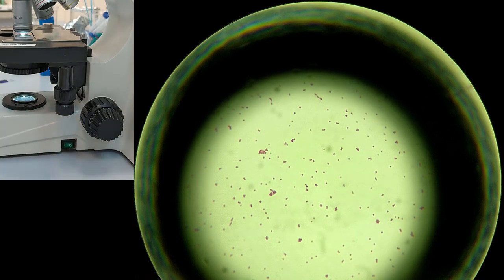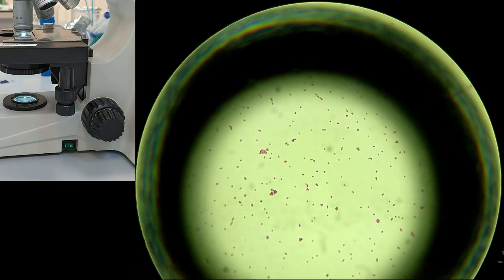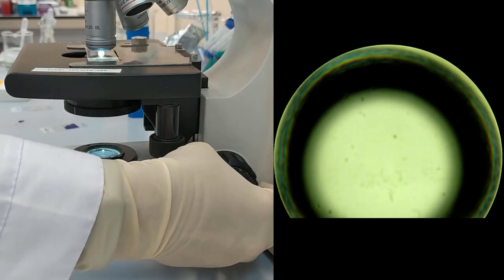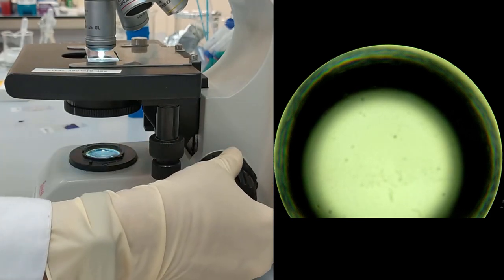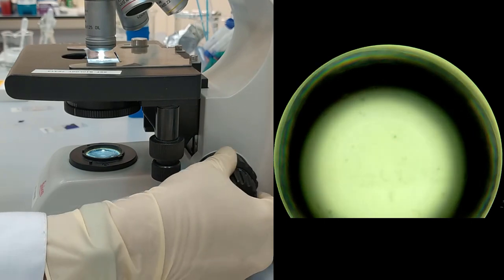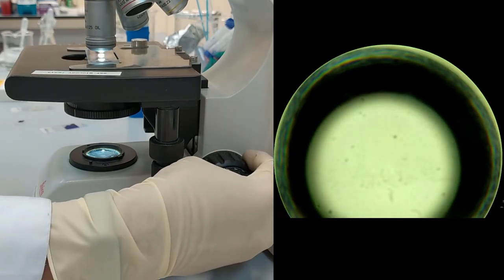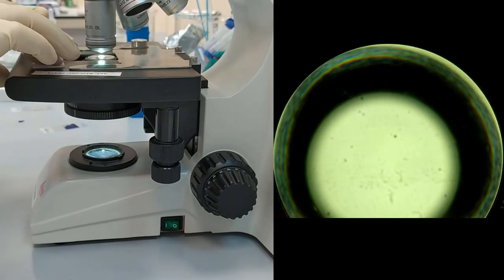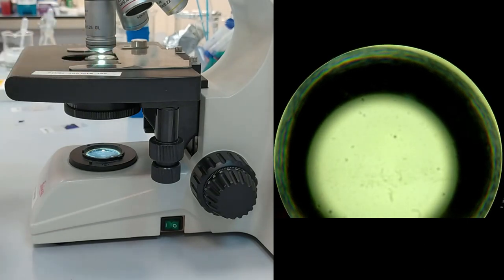So when you finished, again using the big knob, just lower the stage so that you can safely remove the sample. After that, place new sample. In this case, we are going to use the Escherichia coli.